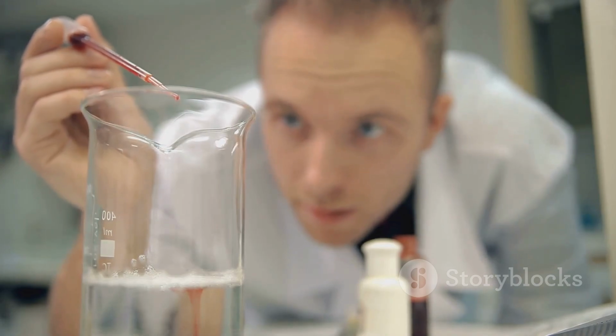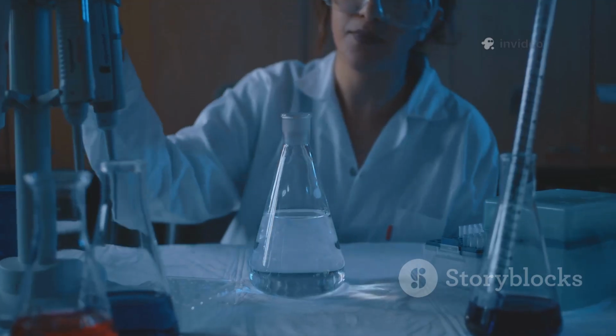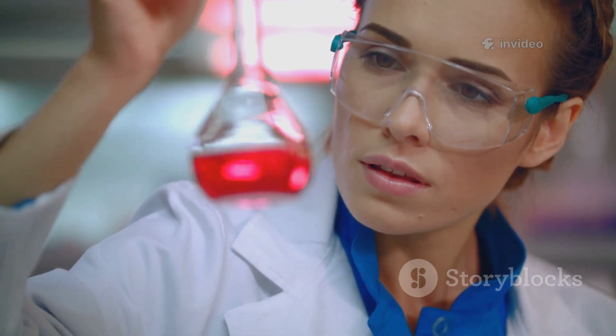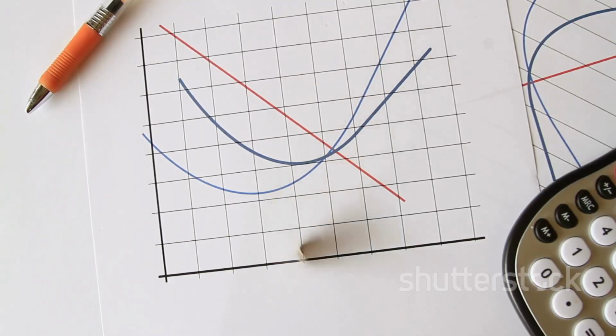So, conductivity drops. When I hit the equivalence point, bam! Most of the strong H+ ions are gone. After that, adding more NaOH means more Na+ and OH- floating around, so the conductivity starts to climb again. Plot those values on a graph, and you get a V-shaped curve. The lowest point? That's your equivalence point.